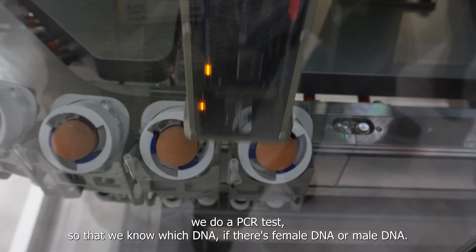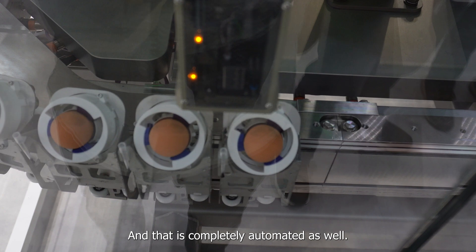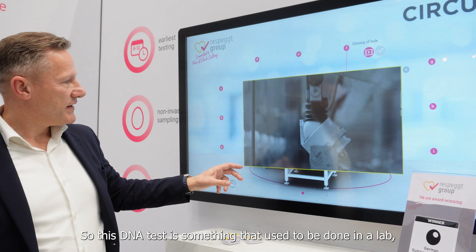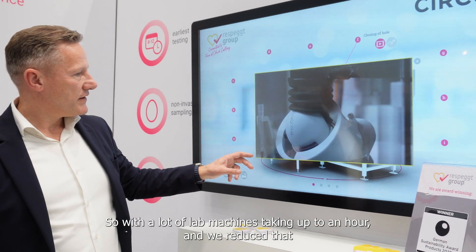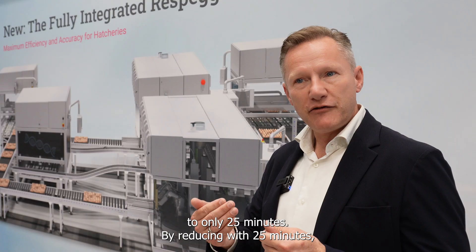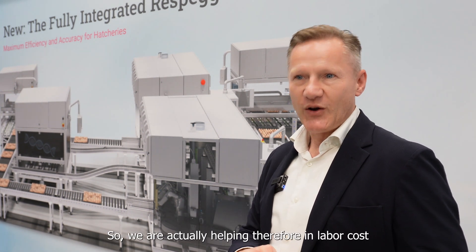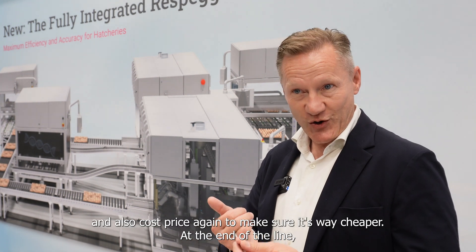We do a PCR test so that we know which DNA is present — whether there's female DNA or male DNA. That is completely automated as well. This DNA test is something that used to be done in a lab with a lot of lab machines, taking up to an hour. We reduce that to only 25 minutes. By reducing it by 25 minutes we bring so much more efficiency to the whole setup, helping with labor cost and also cost price.